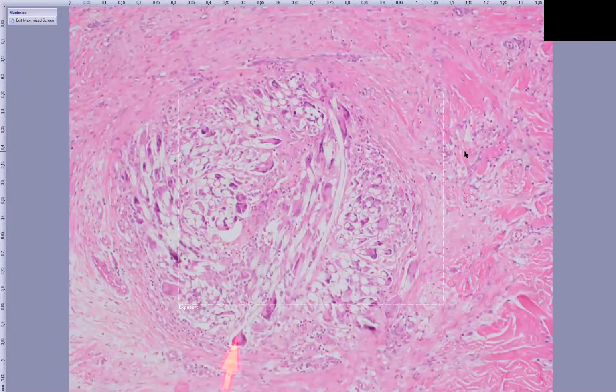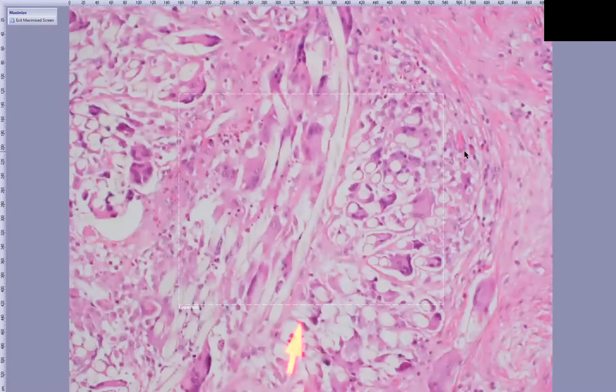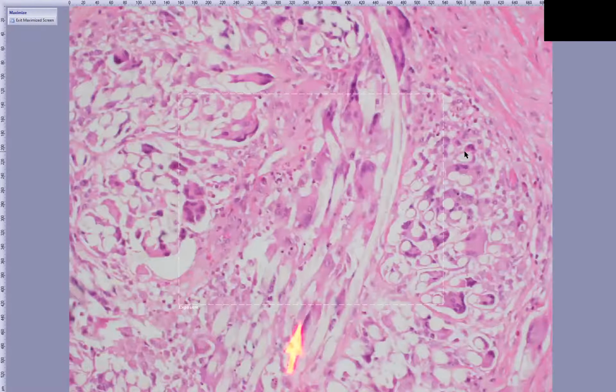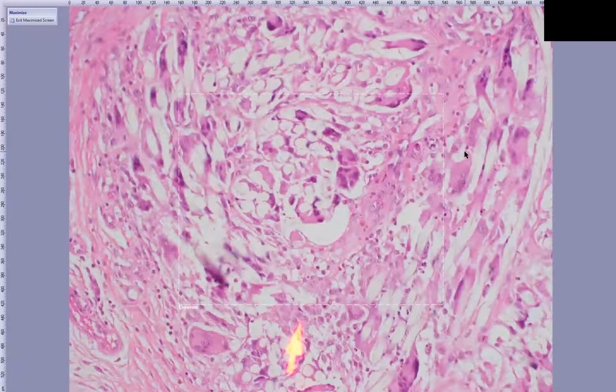And you can see a multinucleated giant cell infiltrate, investing and surrounding these ovoid structures. And when you go in on higher power, those geometric ovoid structures represent suture. So this is a suture granuloma, another type of foreign body granuloma.